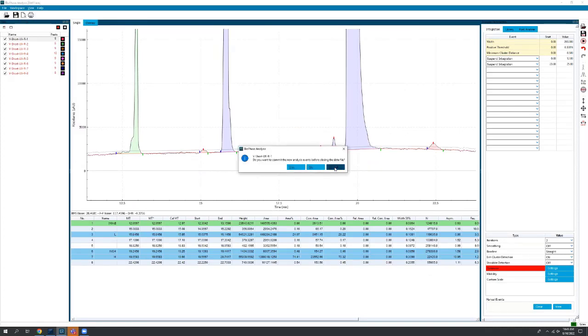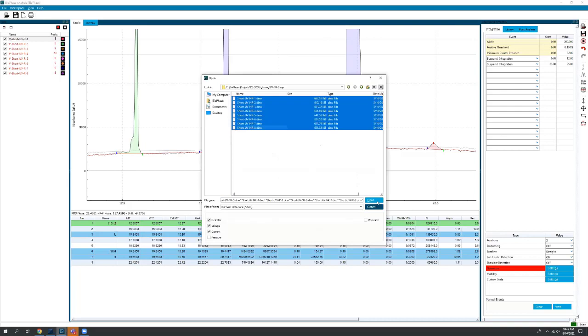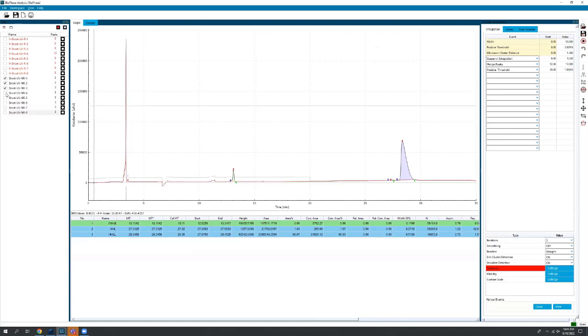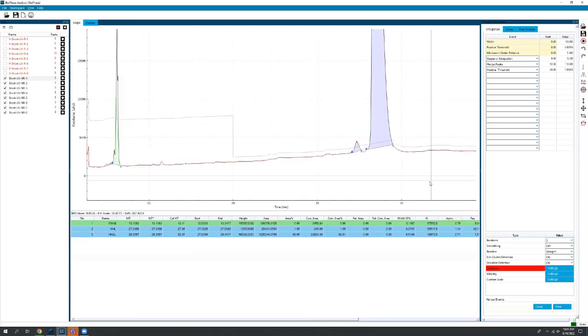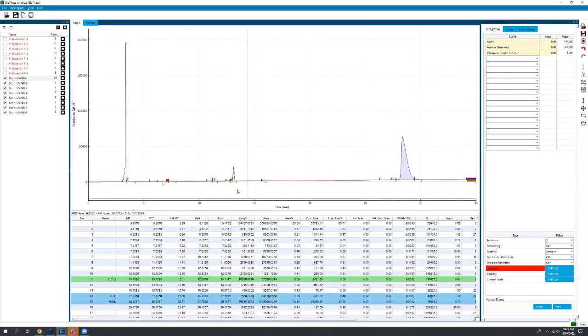So now, actually, what we'll just do is open up our non-reduced data. We don't want the reduced data anymore, so we can just click those buttons to very quickly get rid of those. And let's look over here. We're going to go back to our optimizer, enable that, click OK, click the play button, and see what it does.